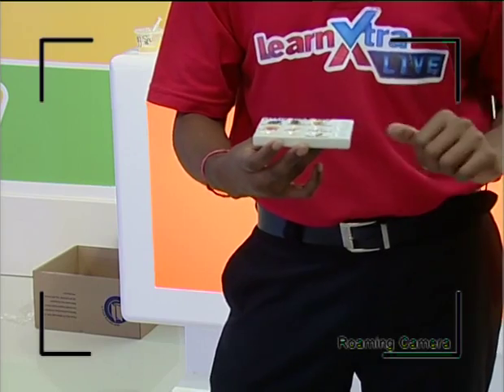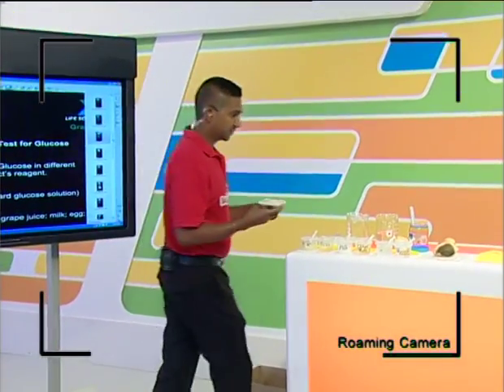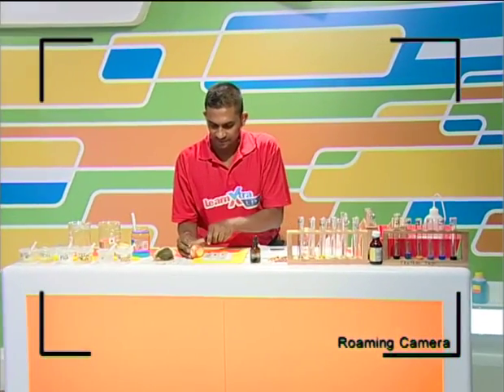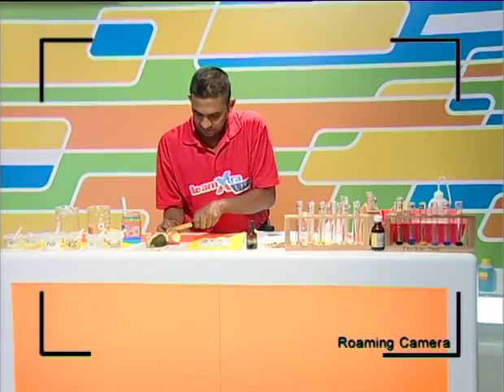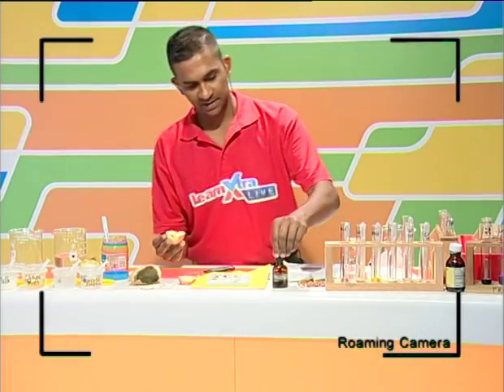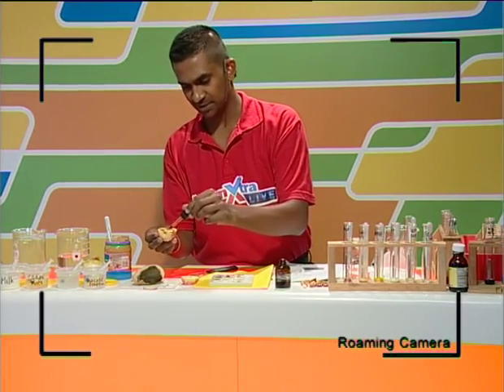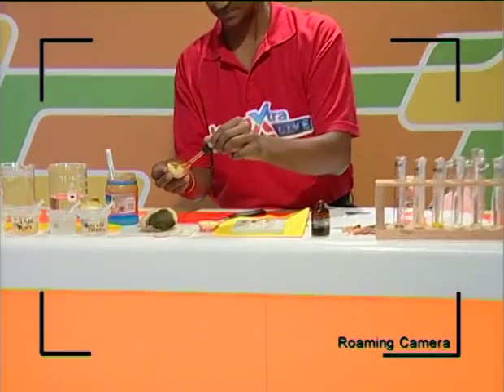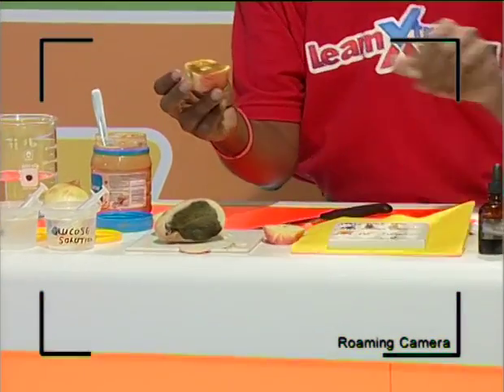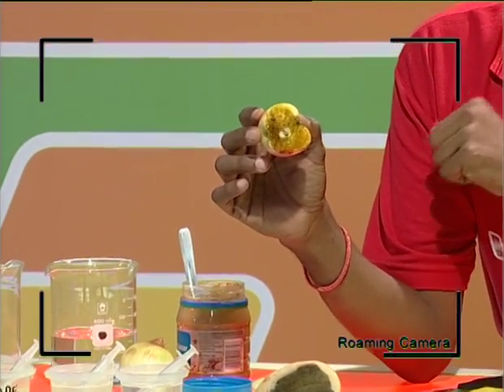So we've looked at these here, and as I wanted to show you the experiment with the apple, I'm going to show you very quickly what happens with the apple. If we were to cut this apple in half, guys, and clearly see this here, this was a question that I set in an exam. I teach boys, and hence I use the word boys, but I asked the learners why it is that when we test for the presence of starch in apples, the color would test positive?